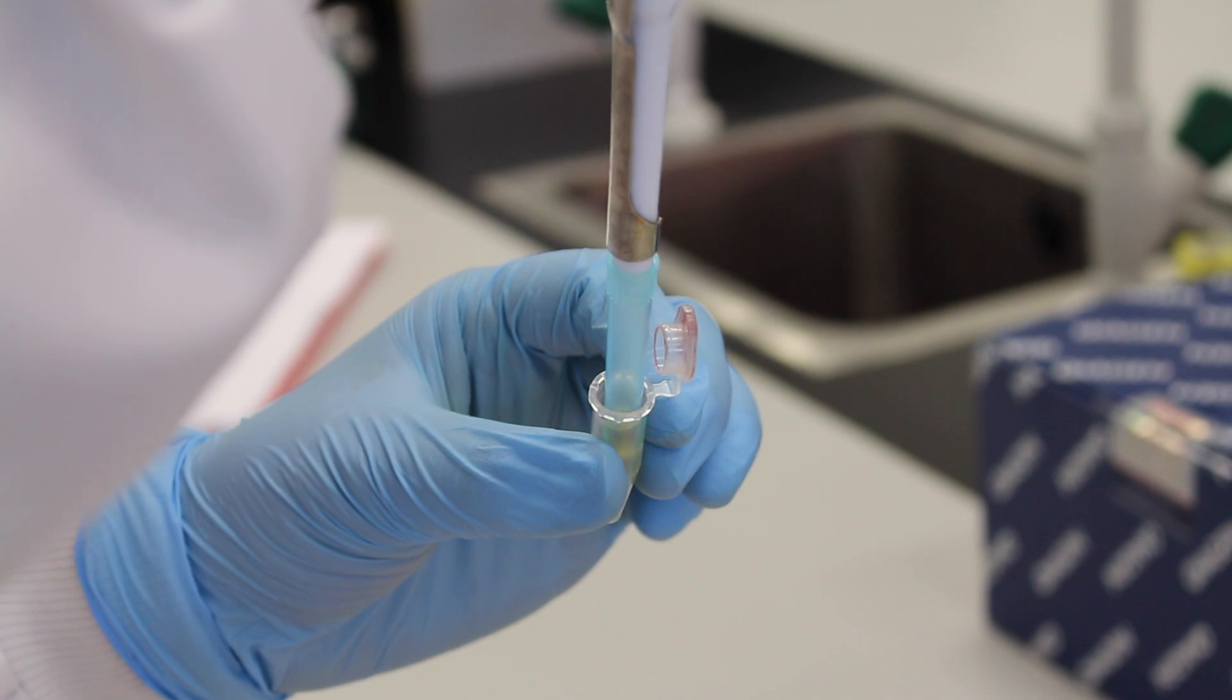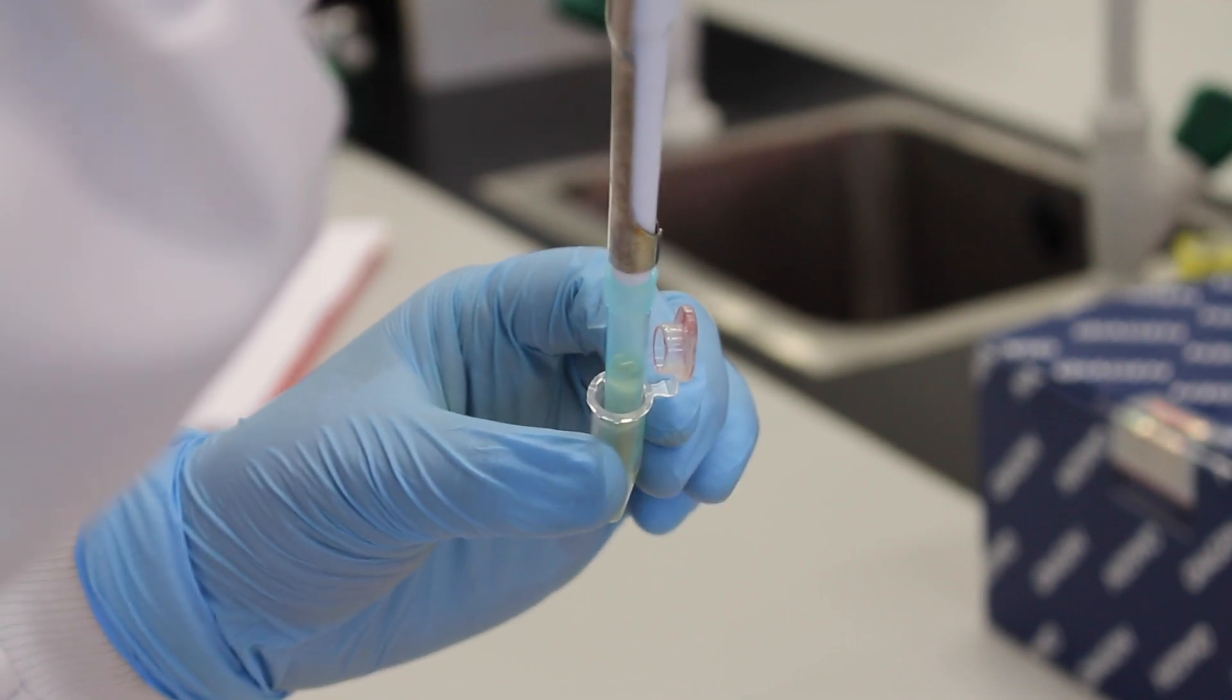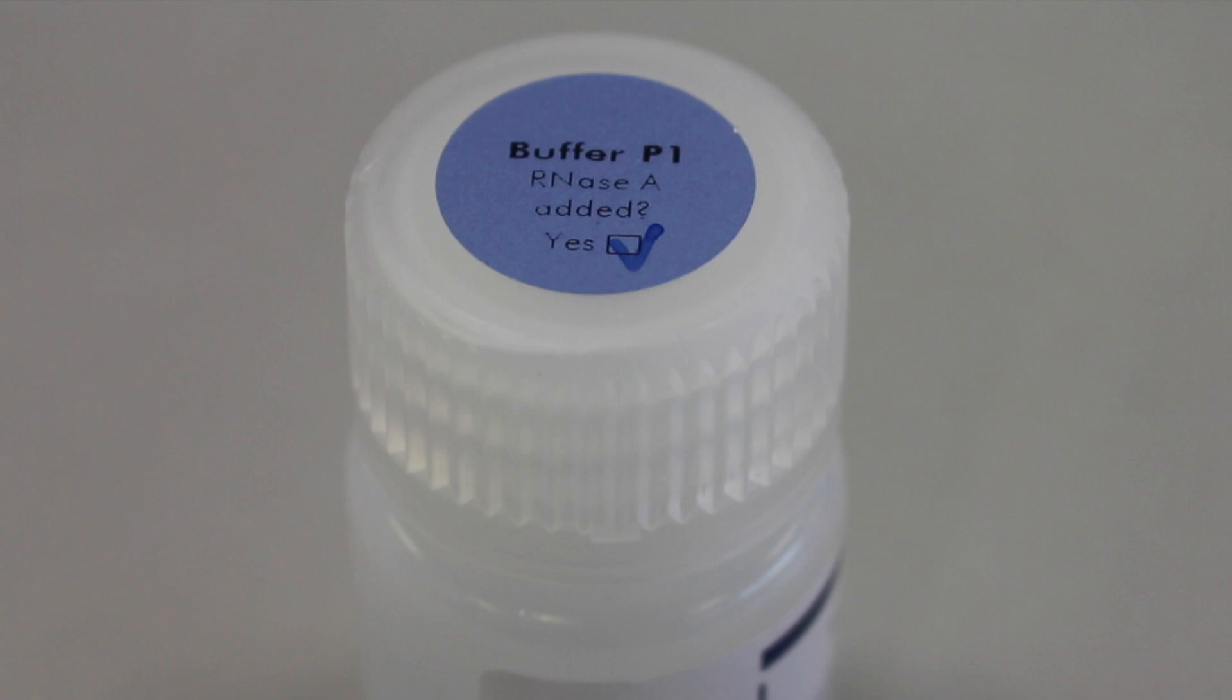The supernatant is carefully removed from each tube. Care is taken not to disturb the pellet. The pellet is then resuspended using buffer P1. Before using the buffer, make sure that RNase A has already been added. RNase will ensure that the cell's RNA is broken down.